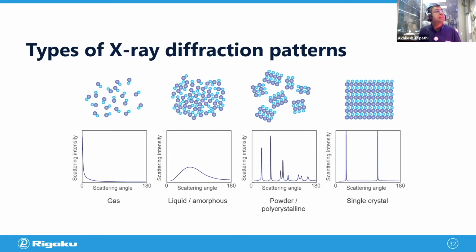That's where the lattice structure, the sort of repeatability that is present in crystalline material, is missing. And hence you see something we call an amorphous hump. It has a lot of information, and it is utilized in XRD in several ways that we will see. However, the information is a lot lesser in terms of having a database for amorphous material. There is no such database. Gases, the atoms are very far apart, and essentially XRD provides little or no information about the gases.